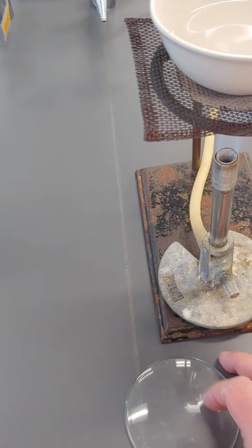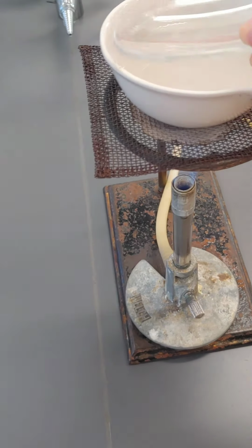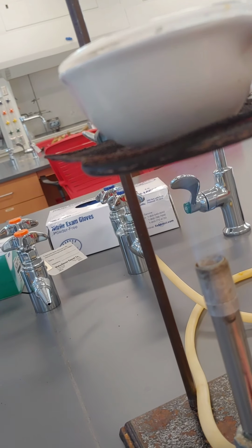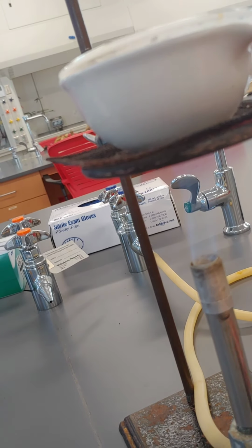So again, I lit my Bunsen burner over here, and then I'm going to place it underneath my evaporating dish, place the watch glass on top, and then kind of adjust the flame a little bit. So I don't want it too high. I want my sample to evaporate, but I don't want it to go too crazy too quickly. And so we'll let that evaporate.